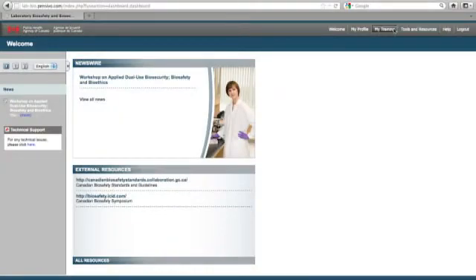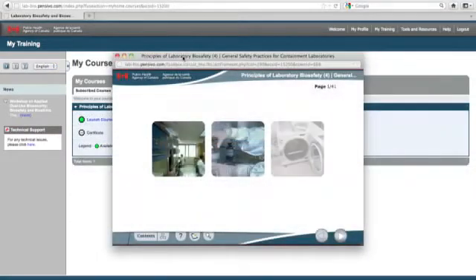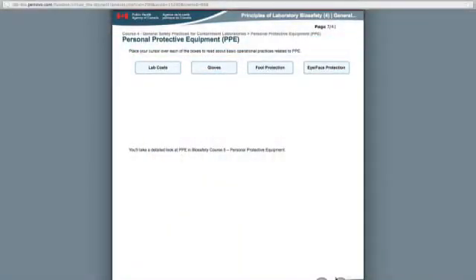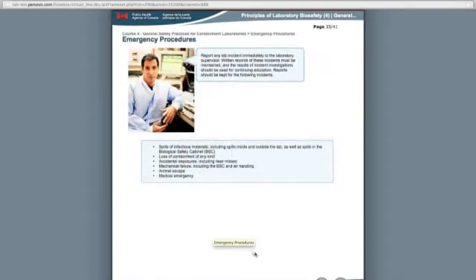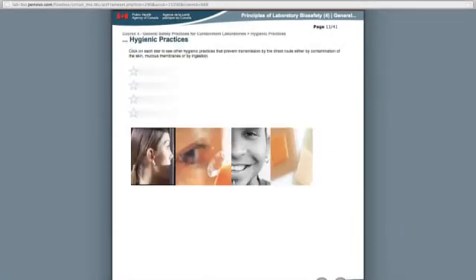The course material reflects this comprehensive approach, offering information on everything from microbiology and risk assessments to laboratory-acquired infections and general safety practices. The course's learning modules are designed with flexibility and ease of use in mind. Each module includes presentations, interactive segments, video clips, and knowledge checks and quizzes.